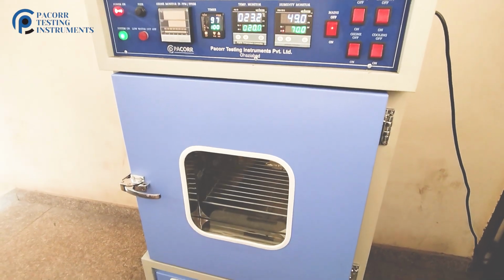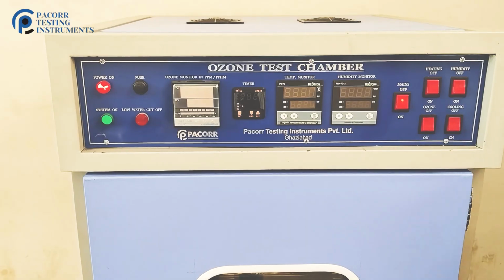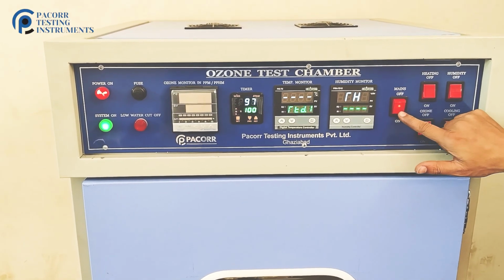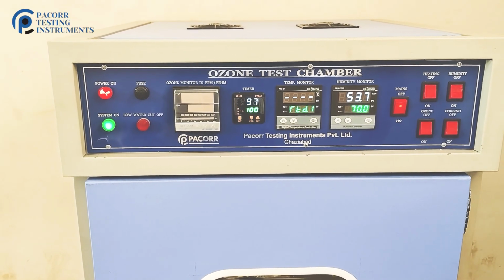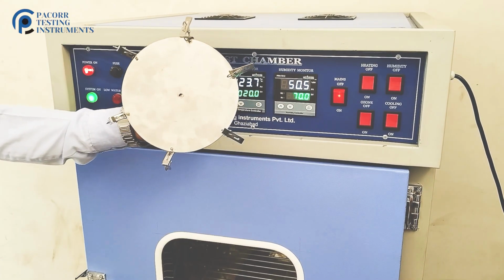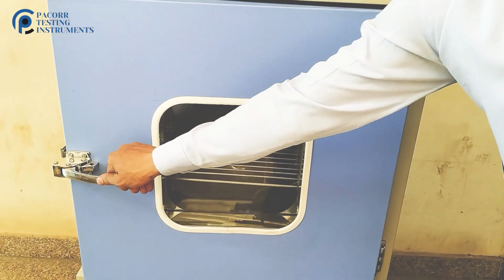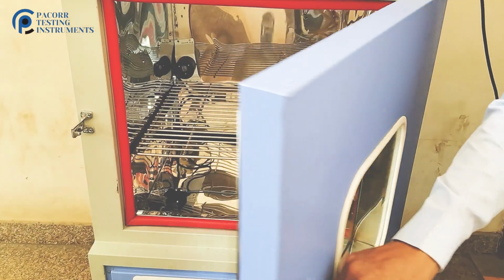All, let's talk about ASTM and ISO standards for ozone resistance testing. In industries like automotive, aerospace, and manufacturing, rubber and polymer materials must withstand harsh environmental conditions. One major threat: ozone exposure. To ensure durability, global standards like ASTM and ISO set strict guidelines for ozone resistance testing.